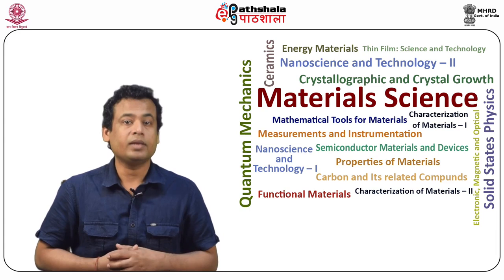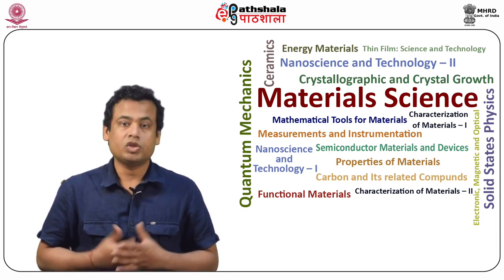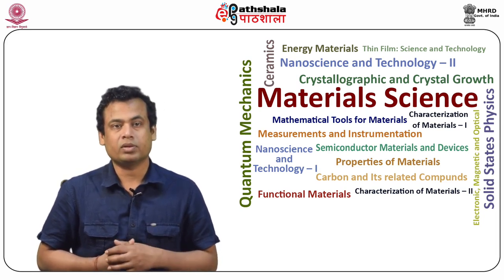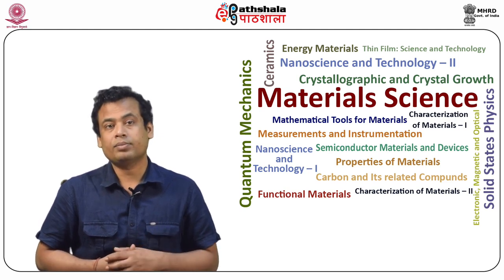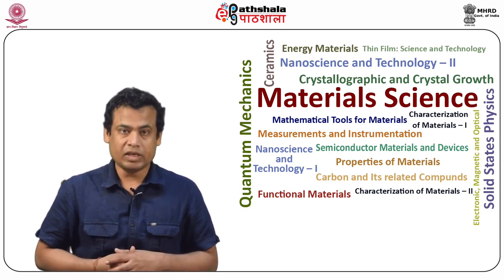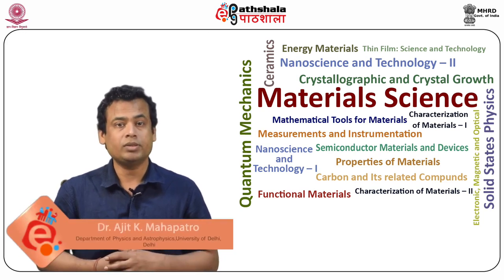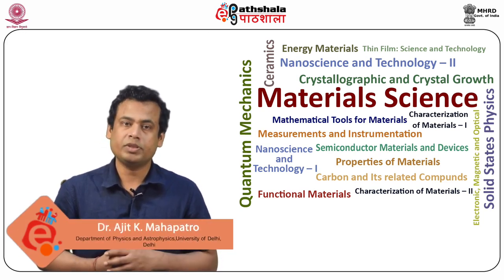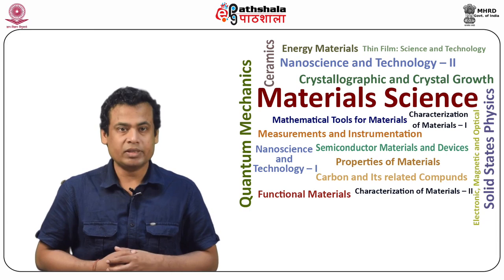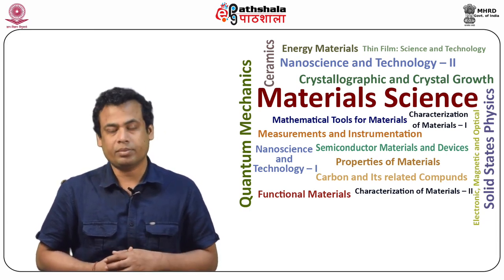Factors like work function, atomic number, beam energy, beam current, and surface tilt can affect the secondary emission of electrons. The backscattered electrons are high energy electrons produced during elastic scattering and can be affected by factors like beam energy, tilt, and atomic number of the specimen. The interaction volume increases with increasing acceleration voltage and decreases with increasing atomic number.